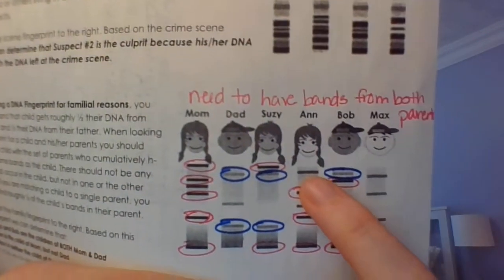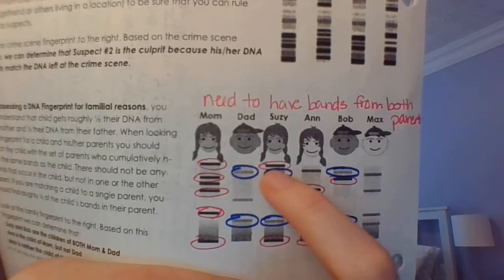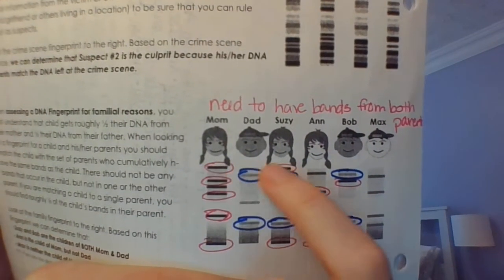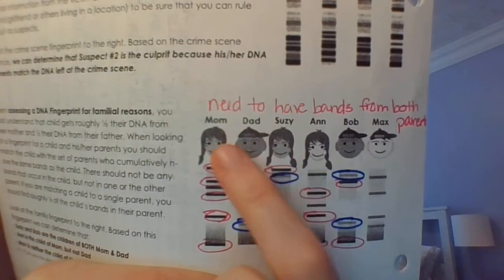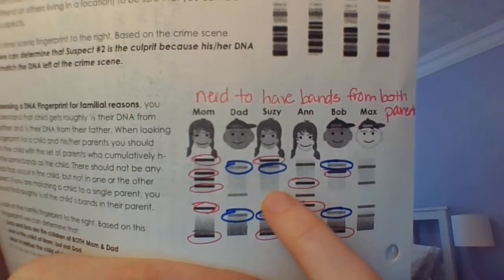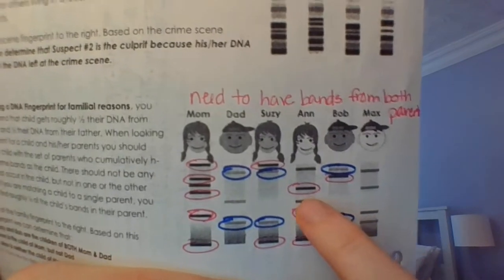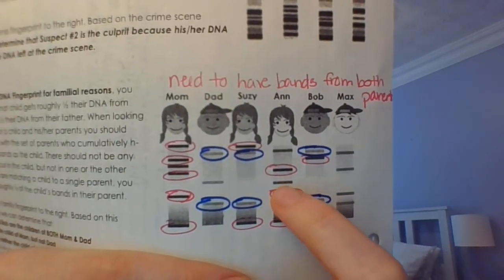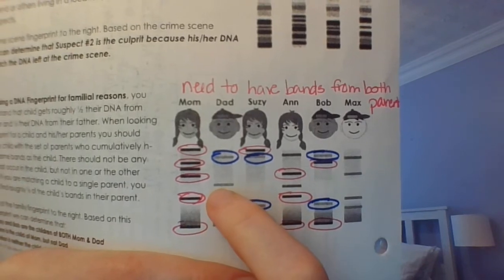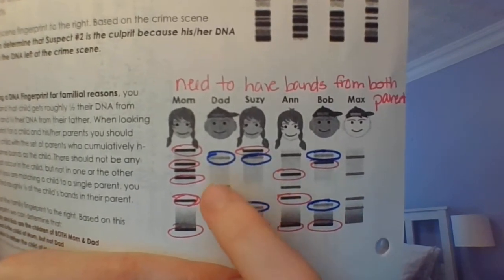Okay, then we're going to go to Anne. Anne has a band right here. If you notice, neither parent has a band right here. So that's telling us at least one of these is not Anne's parent. Okay, and second band's right here. Mom has a band right there, so that one is accounted for. And third band right here. If you notice, they are not the same. So that's not from the dad.